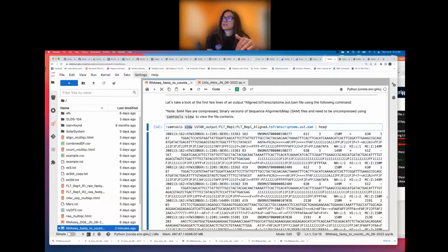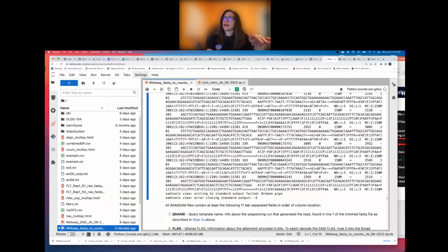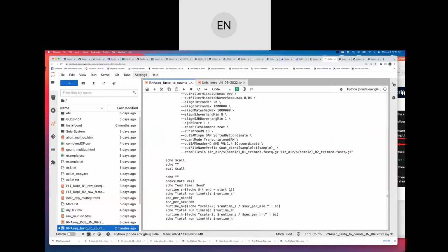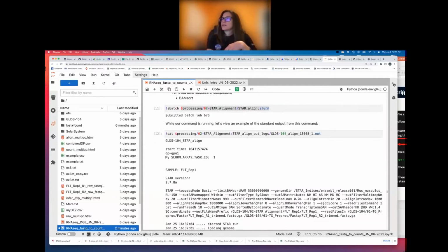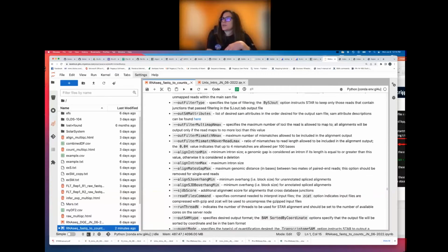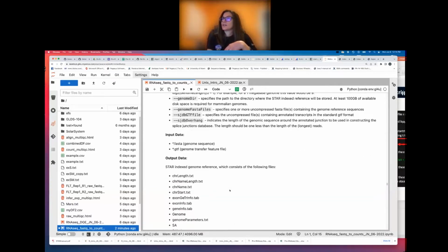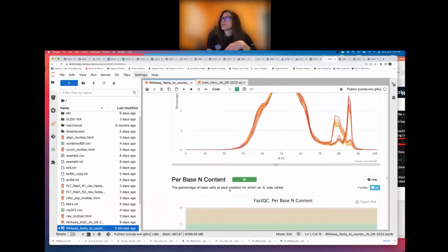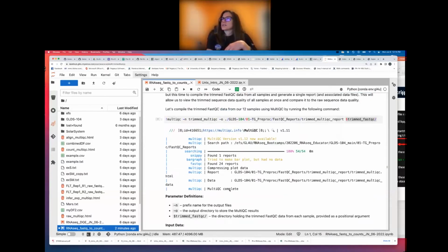So when it runs into this head command that stops it after the 10 lines, samtools view will say that it had to stop writing after those lines because you broke that tool by piping it into head. So that's to be expected. We saw a similar thing up here when we were opening up a file with cat. I think we were opening up our FastQ files before the FastQC that we did.